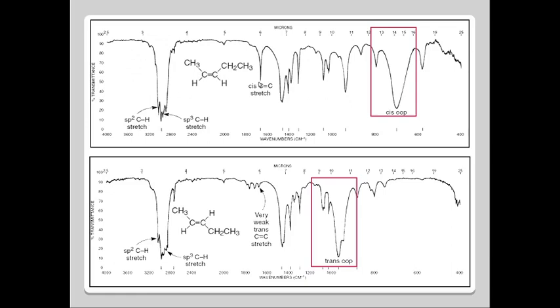And this typical band which we have seen earlier is a sharp peak due to the carbon carbon stretching frequency of a typical cis isomer, and this one is the out of plane bending vibrations of all these functional groups which are being arranged in a cis configuration around these ethylene carbons. Okay, which is a broadened single type of band here.